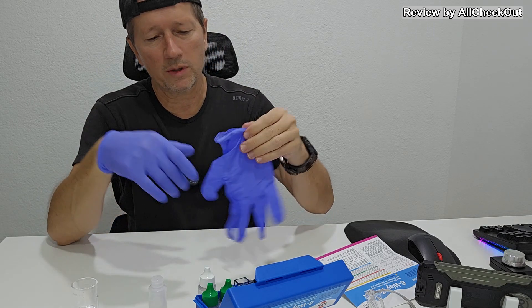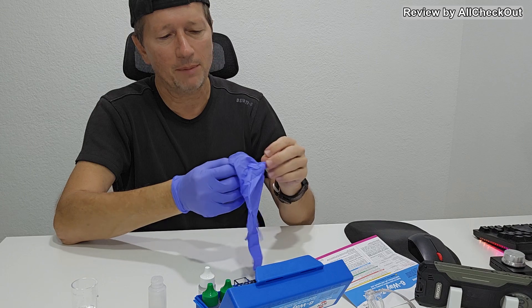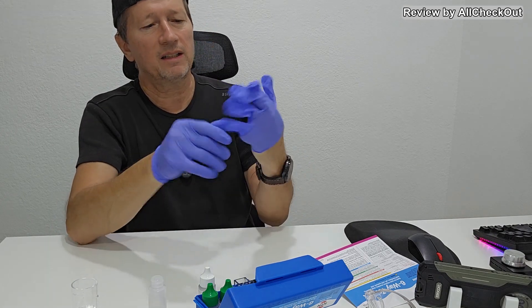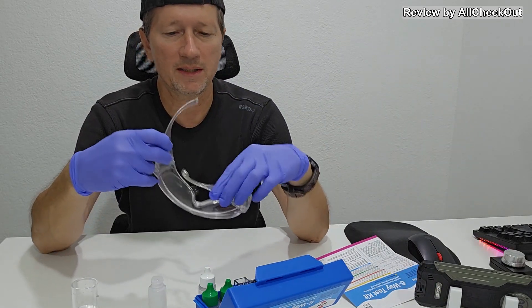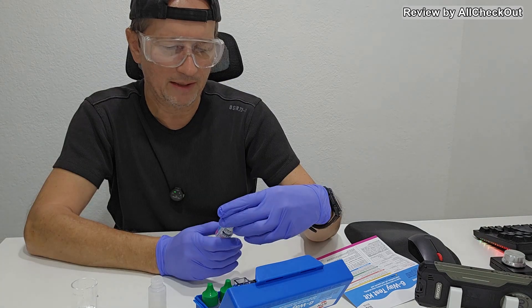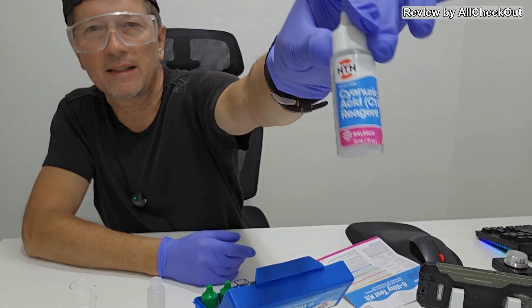I'm using here some gloves, maybe have also some towel ready, paper towel or something like that in case you're producing some spills. And then I'm using also these safety goggles. Now we need this cyanuric acid testing chemical.